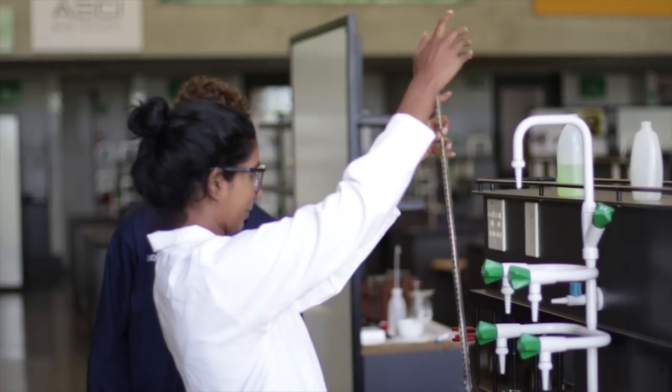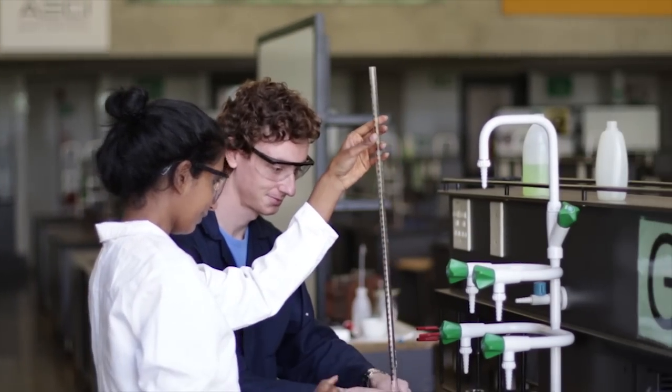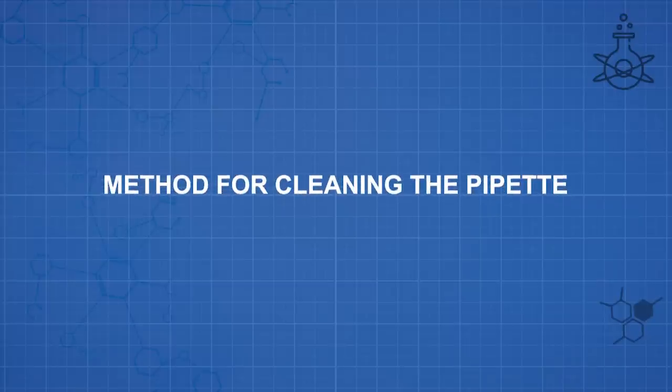However, if there are any problems with your burette, ask your demonstrator for assistance. Method for cleaning the pipette.